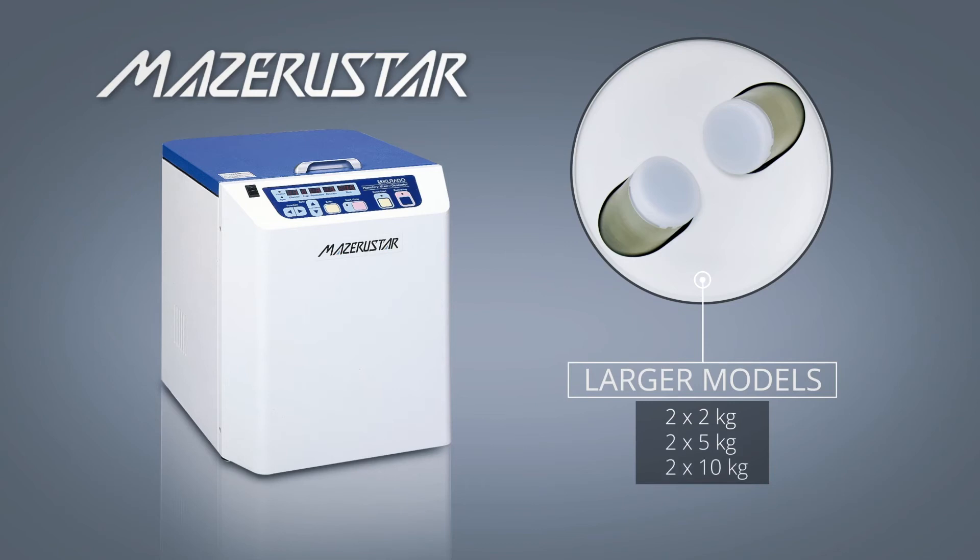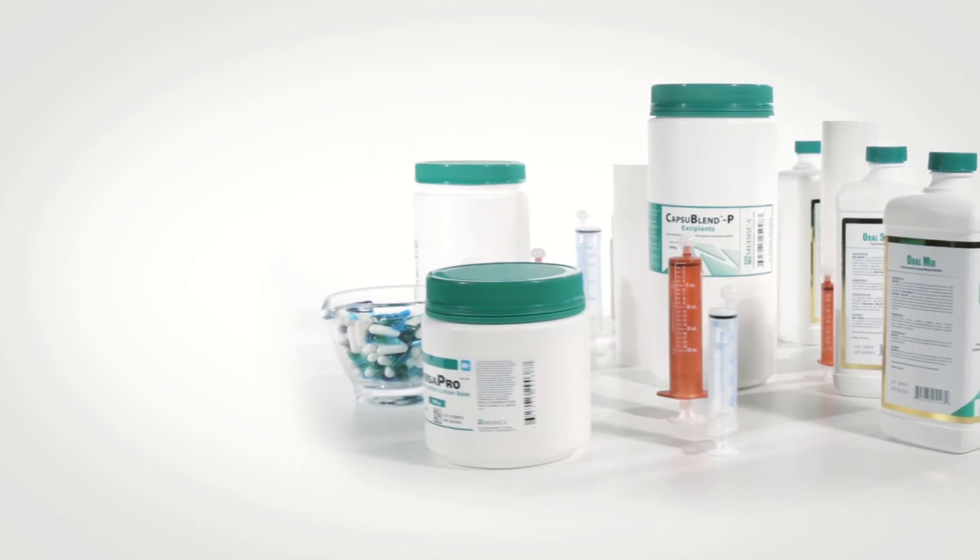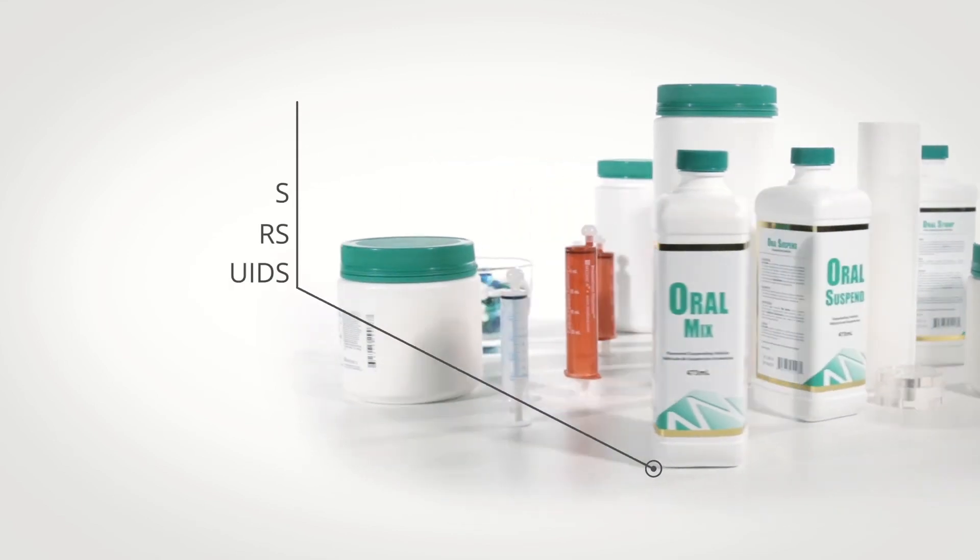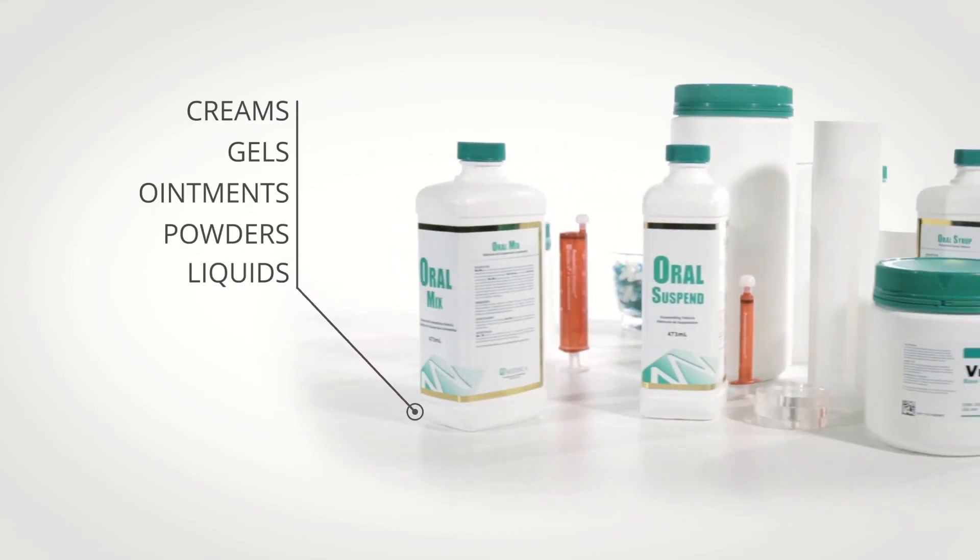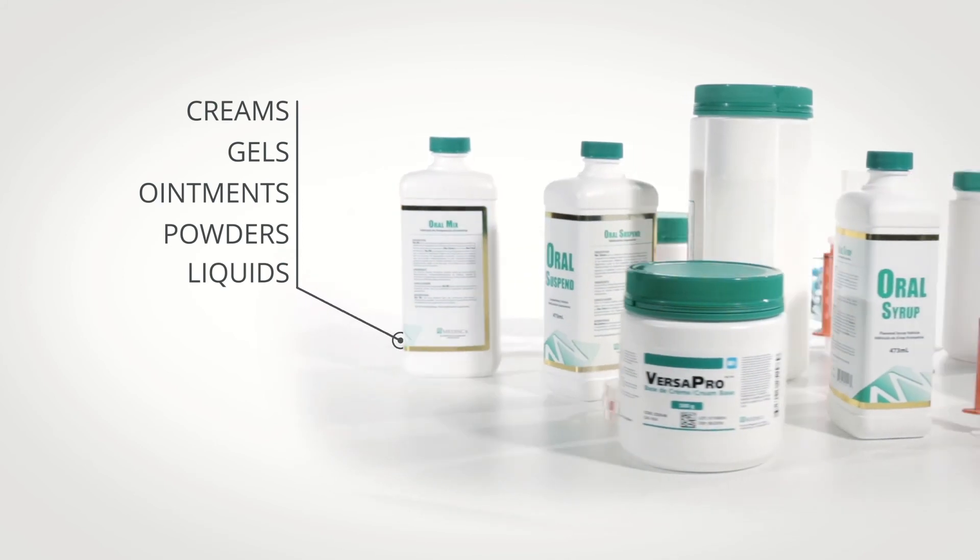The sky is the limit with MESS technology as it is ideal for mixing creams, gels, ointments, powders and liquids.